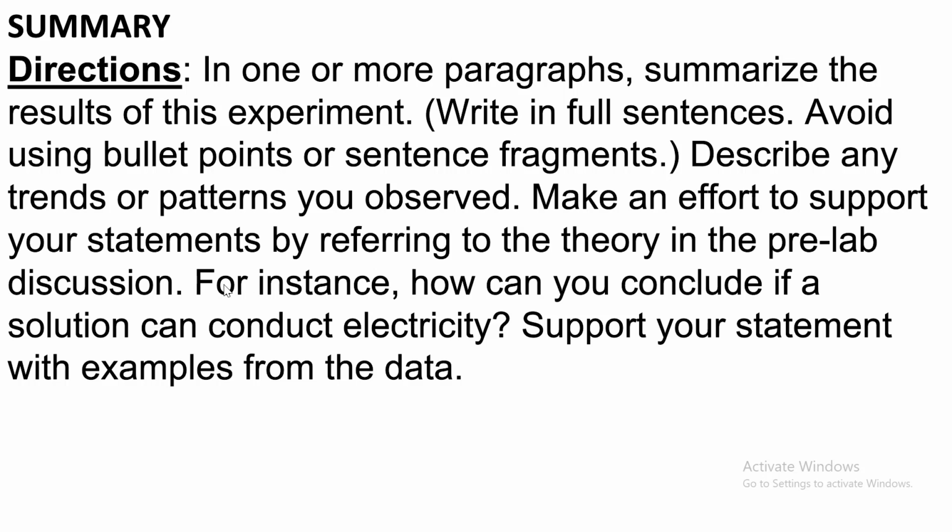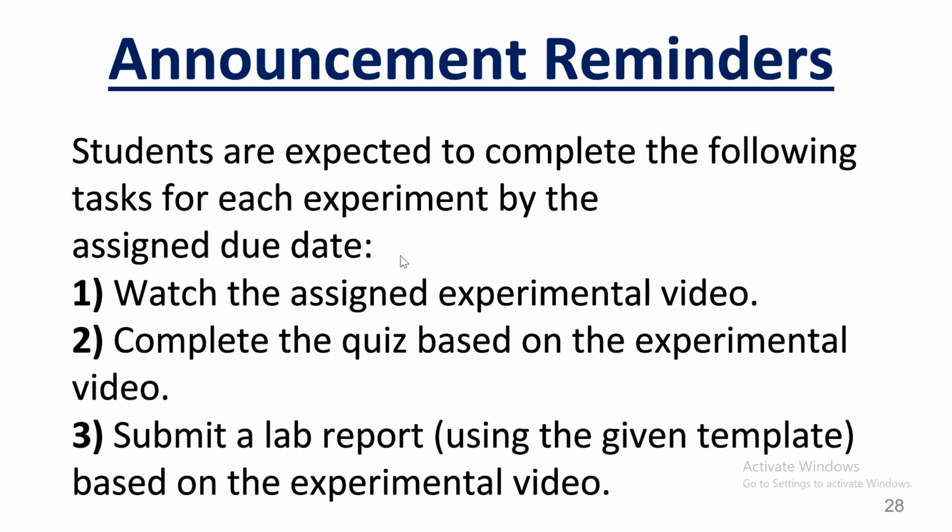For instance, make sure you talk about how we can conclude if a solution can conduct electricity. Make sure to tie it back to the apparatus that you looked at, which includes the light bulb. If the light bulb becomes brighter, that means the substance conducts electricity. You have to support your statements with examples from the data from today's experiment.